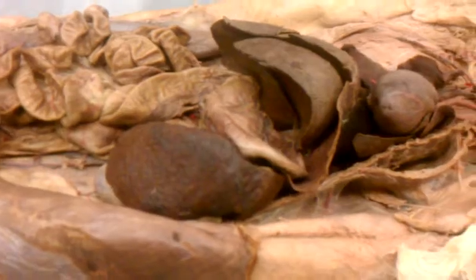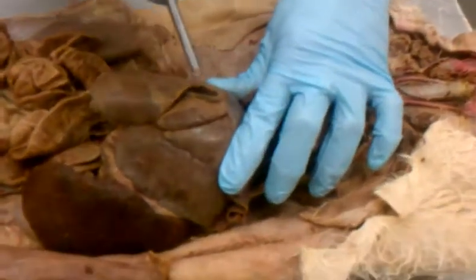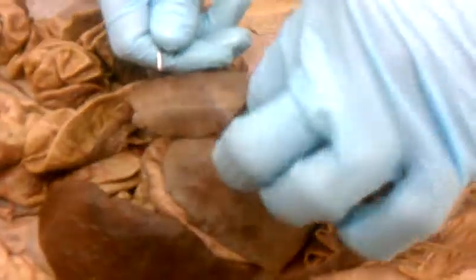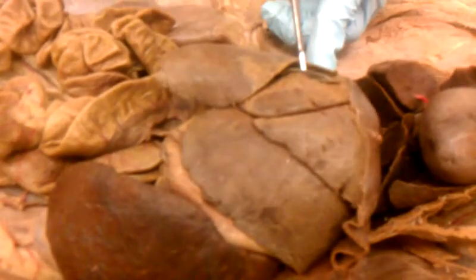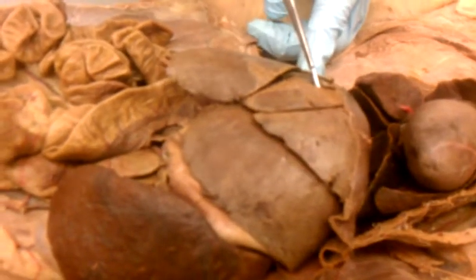Alright. Okay, then you have the accessory structures. So, in your liver, you have this nice little popped thing right here. It's kind of popped. That is your gallbladder. It's like a balloon that's been popped. So that is your gallbladder right here. On the list. It's in between the lobes of the liver. That's the gallbladder.